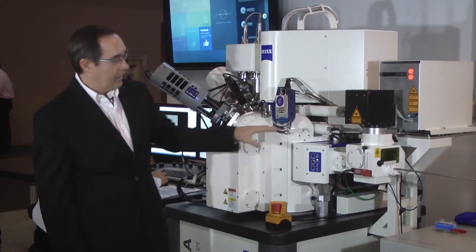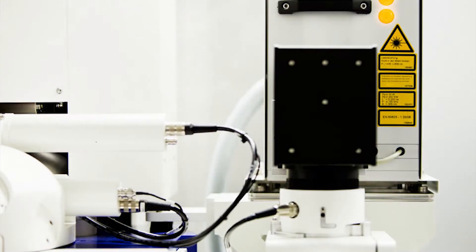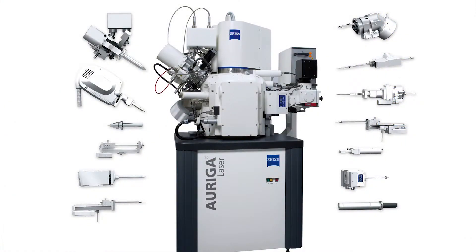The advantage of having the laser out on the side rather than embedded in the whole chamber is that since we're removing such large amounts of material, we don't have to worry at all about whether that material gets redeposited to anything inside the chamber.